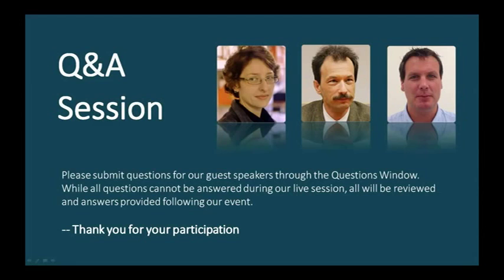Excellent. One question that has been consistent throughout our whole experiment is whether the IntelliCage can be used for rats. So Holger, can you comment for our audience on that? Yeah, the IntelliCage was initially developed for automated phenotyping in mice, but for about 4 years we have transferred that concept into a larger central arena, about 1 meter by 1 meter, which can house rats and includes larger corner and larger nosepoke units.